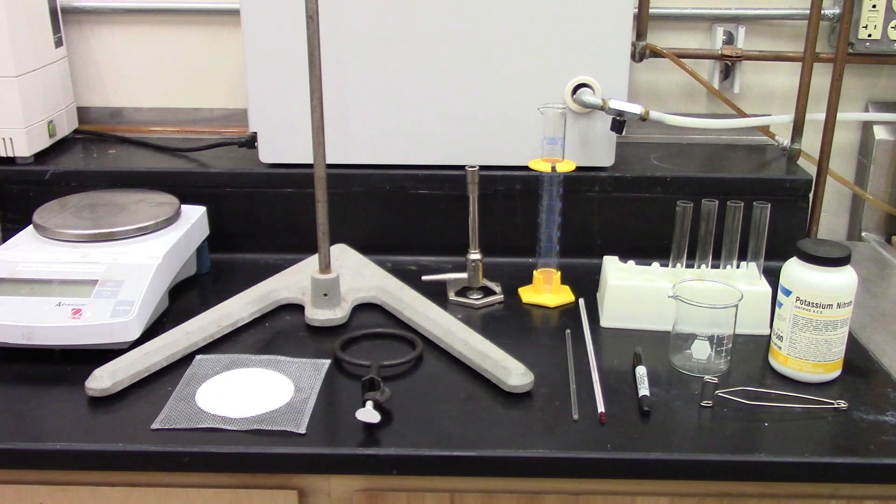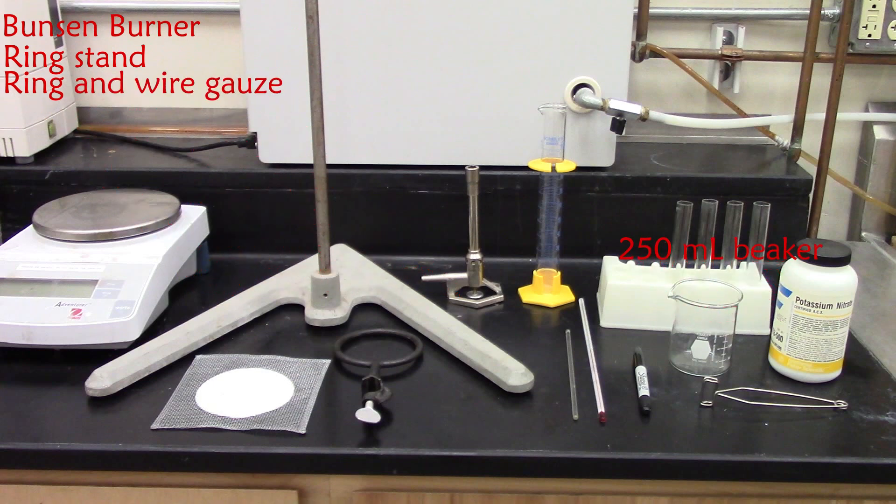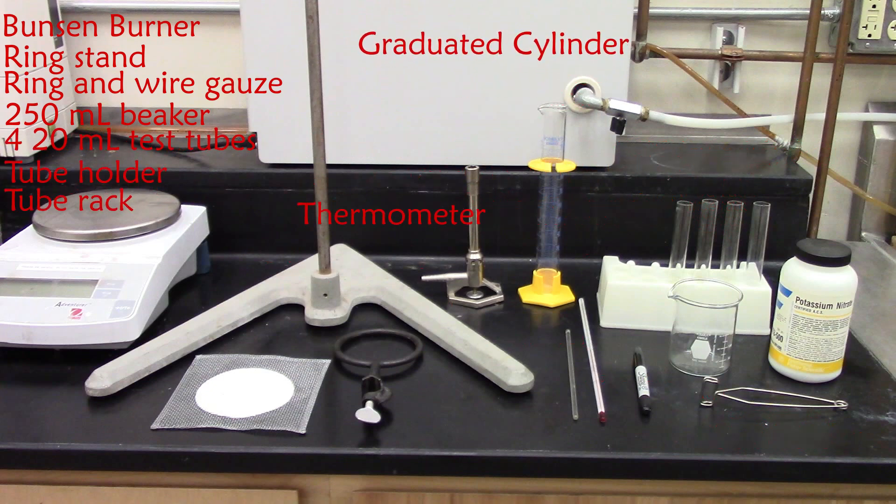To conduct the exercise, you will need a Bunsen burner, ring stand, ring and wire gauze, a 250 mL beaker, four 20 mL test tubes, a tube holder and rack, thermometers, graduated cylinder, and a marker for labeling test tubes.